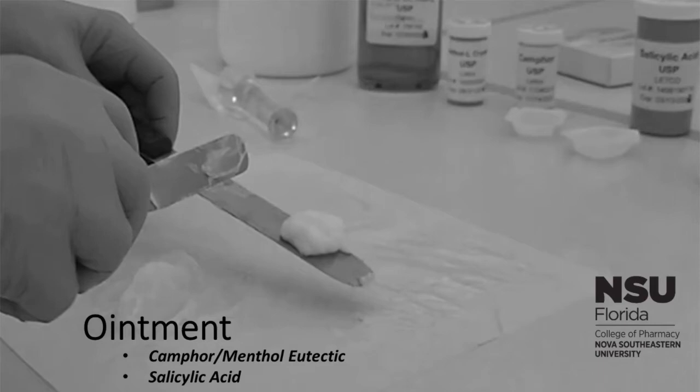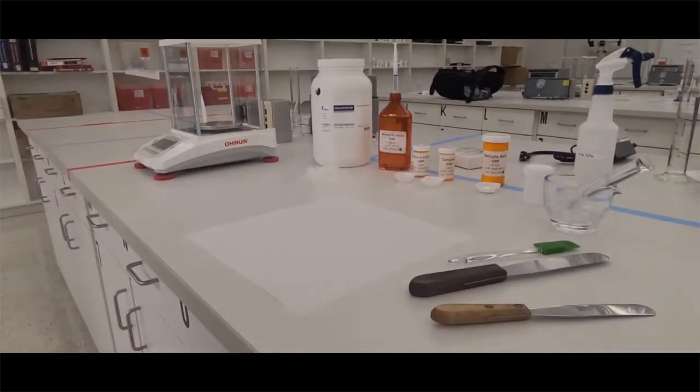Okay, this video is going to be for the topical ointment we're going to make with camphor menthol eutectic and salicylic acid.